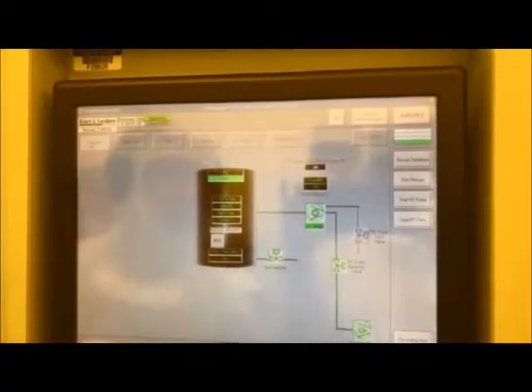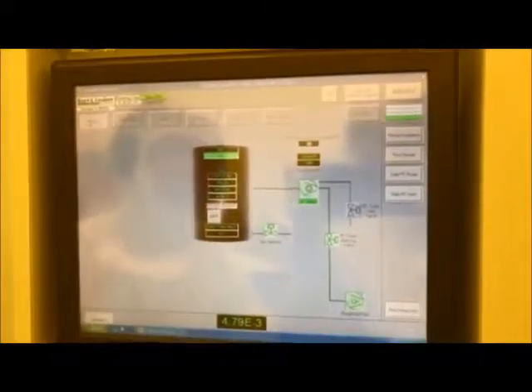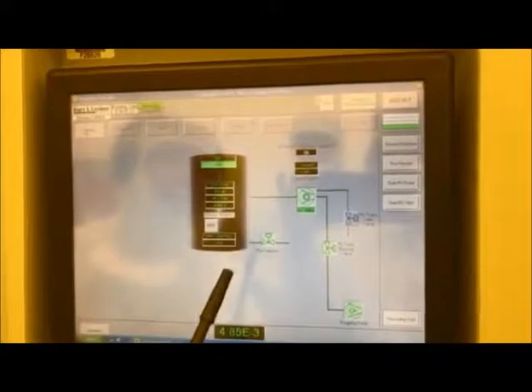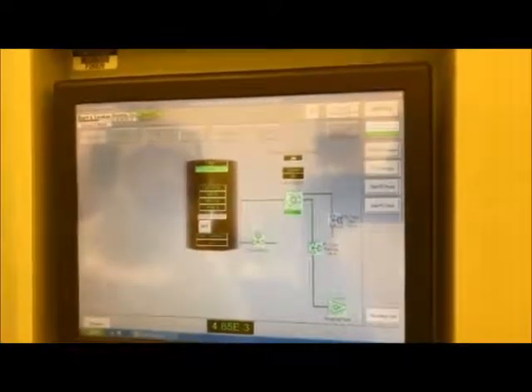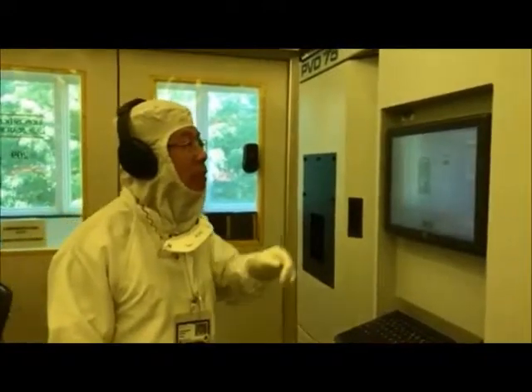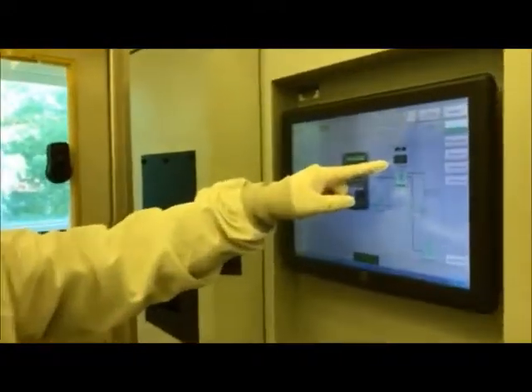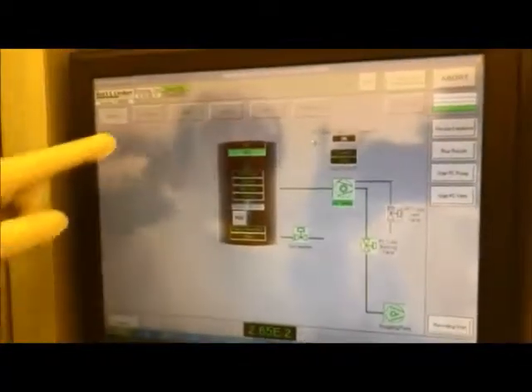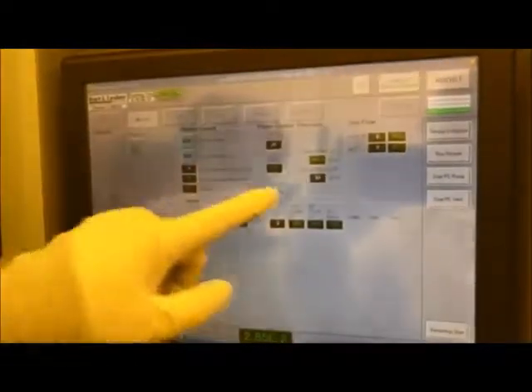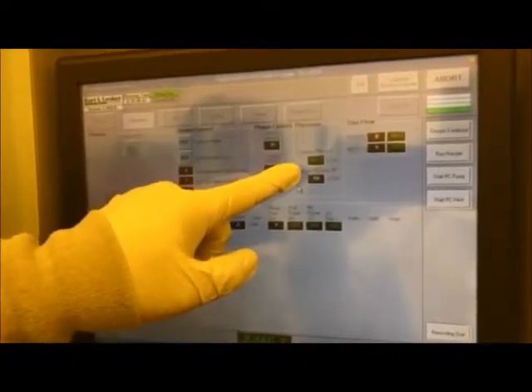This could take up to 15 minutes for the turbo to wind down, and we have to wait until the turbo speed is at 30. After about 10 minutes, you can see the turbo speed is now at 30%. Remember, the green is the actual turbo speed. We set it at 30%, and we also check the pressure. The pressure we set at 15 millitorr, and now it's close to 15 millitorr.